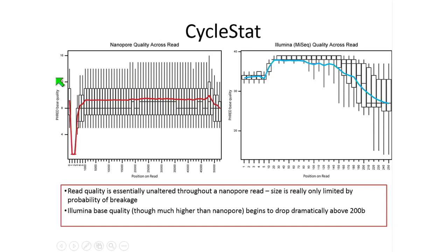And it should be clear from the description of Nanopore sequencing that there's no effect of read length on error quality, so quite different from short read technologies where you're reading a clonal population of molecules and where you're suffering from issues of the clones going out of phase due to incomplete incorporation of molecules. You don't get that with Nanopore sequencing. You're reading the natural strand, and so the signal is very uniform, so you get the same lowish quality all through the read.